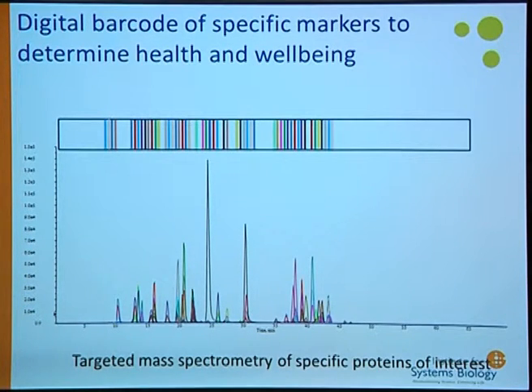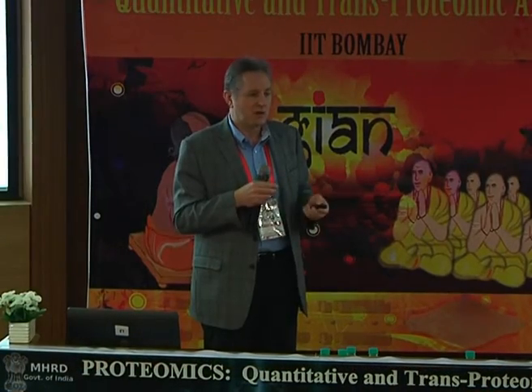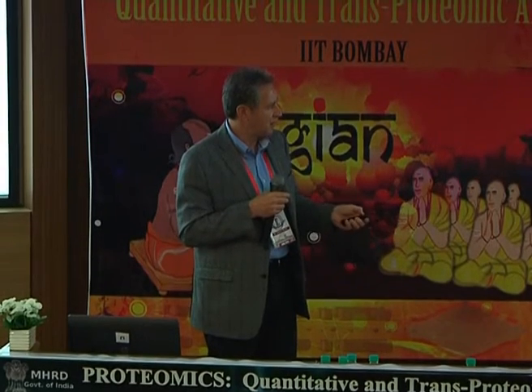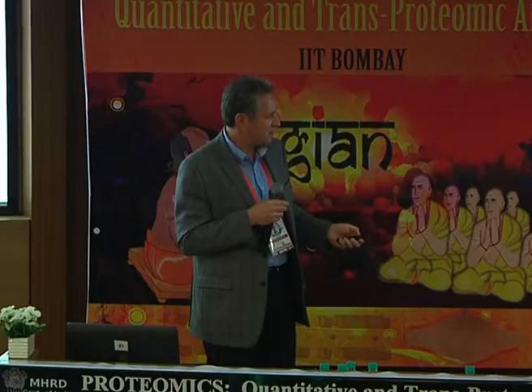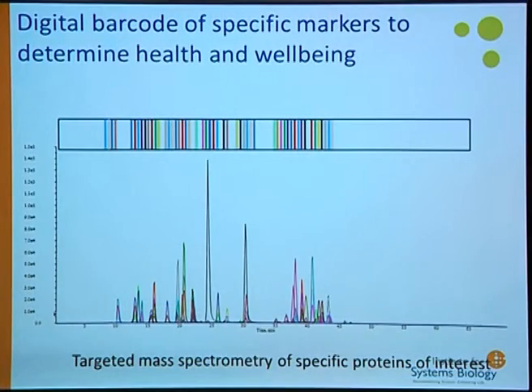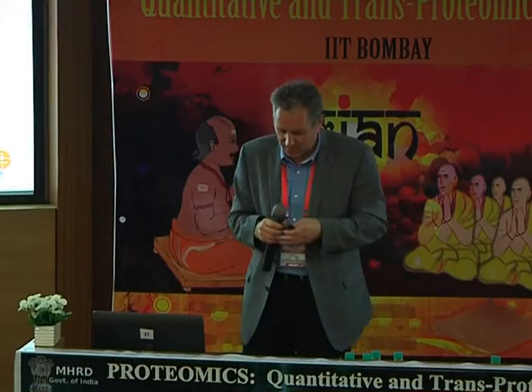If you're looking for a pathogen in certain foodstuffs, you can create peptide signatures for each of those and just measure them over and over in time. What you're doing is looking at the abundance change of each of those signatures. With that, what we're really trying to do is create a resource, now that we have all of the peptides that are known for a whole organism, as well as utilize those in quantitative analysis. And so Dave will start off now with the PeptideAtlas.